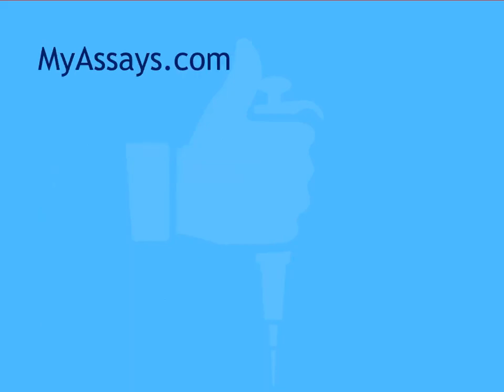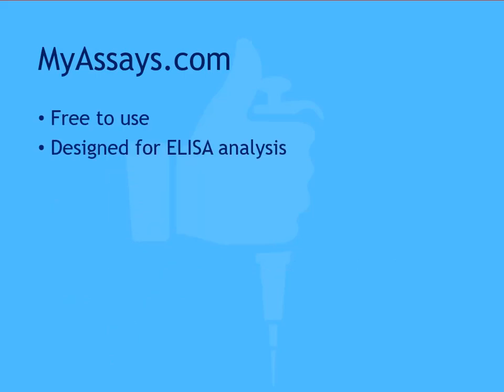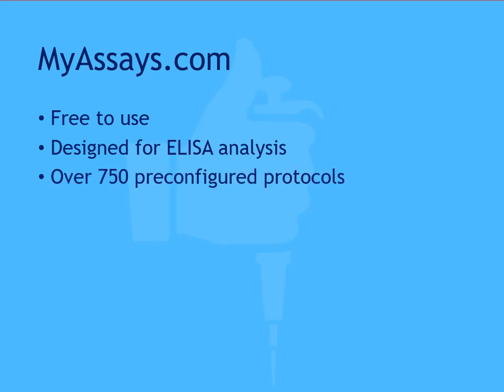In contrast, MyAssays offers a free online data analysis tool specifically designed to perform ELISA analysis. MyAssays.com includes over 750 pre-configured analysis protocols comprised of common curve fit methods such as 4PL and 5PL, as well as commercially available assay kits. The user interface is designed specifically for ELISA applications so that you can easily enter and store the data and parameters for your assays.